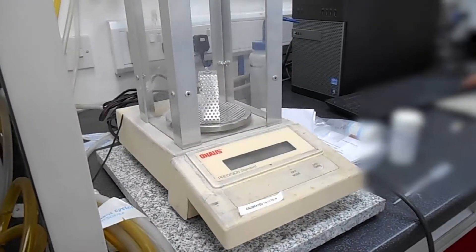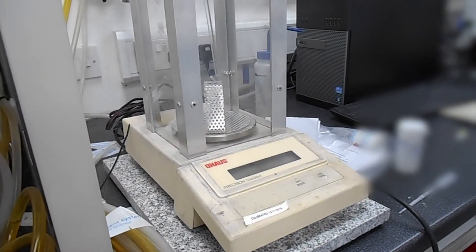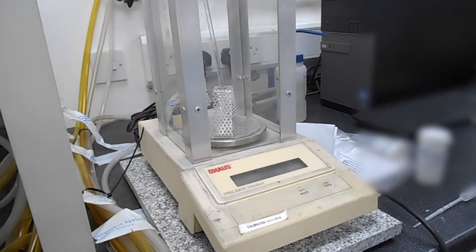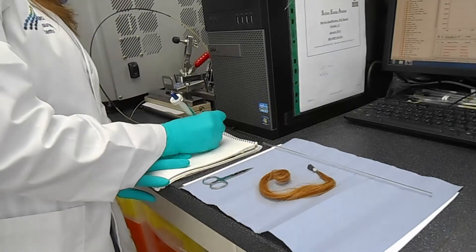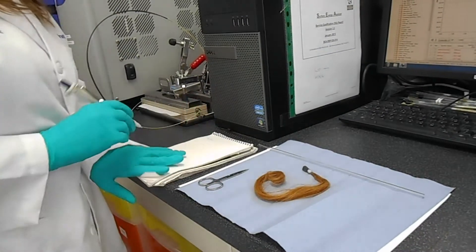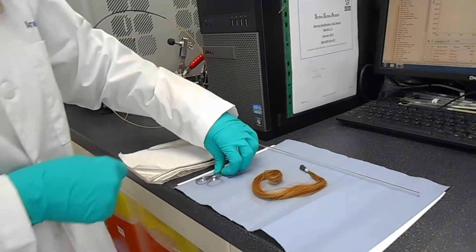The first thing that we need to do before the experiment is to weigh an empty column. We should record the measurement so we are going to be able to detect how much sample we are going to use.